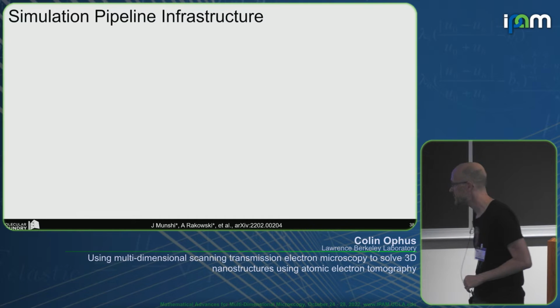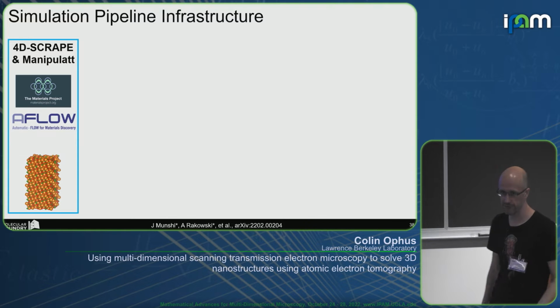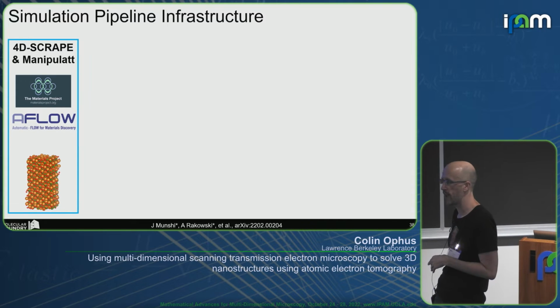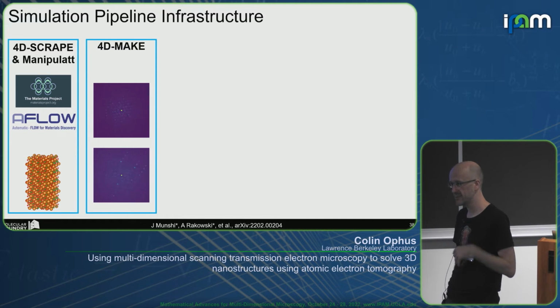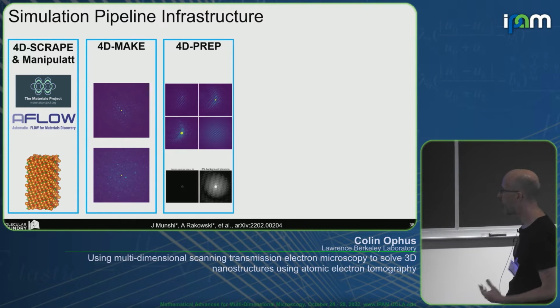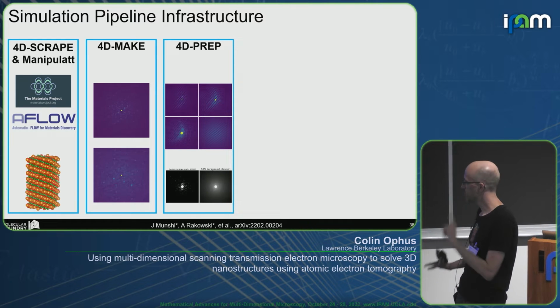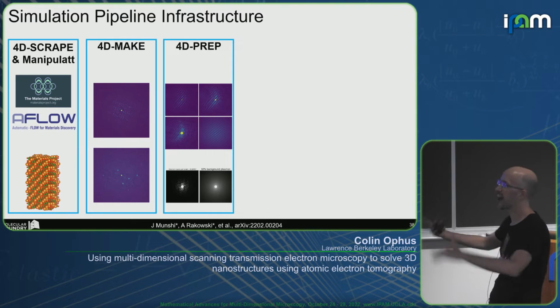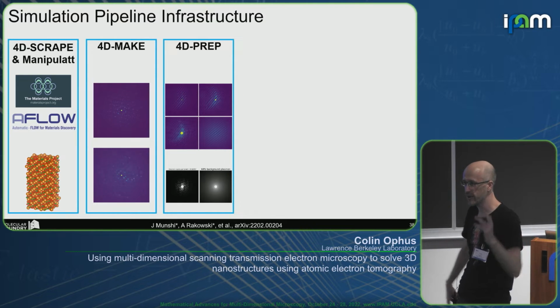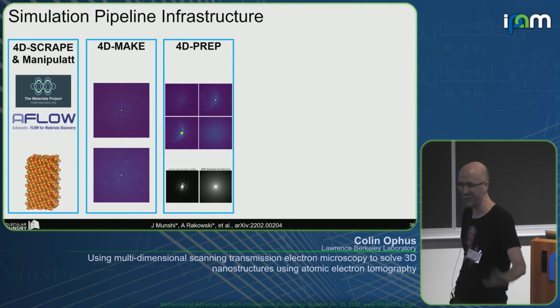So what do we do? We take every single crystal structure out of AFlow and Materials Project and soon Nomad. We simulate hundreds of thousands of different orientations and different crystals. We augment the data. This is what Hulin was really focusing on, how important it is. Random shifts, dead pixels, hot pixels for X-rays, inelastic background, ellipticity of the pattern, Poisson noise, fixed Gaussian pattern noise. You name it, we gotta augment it.